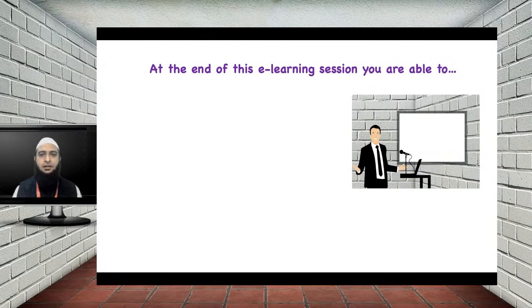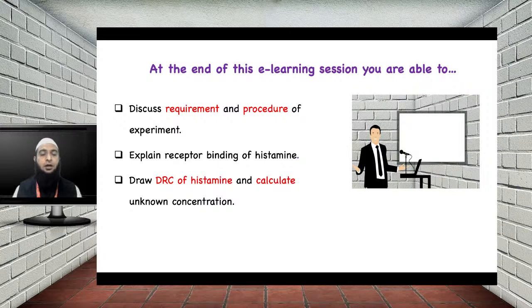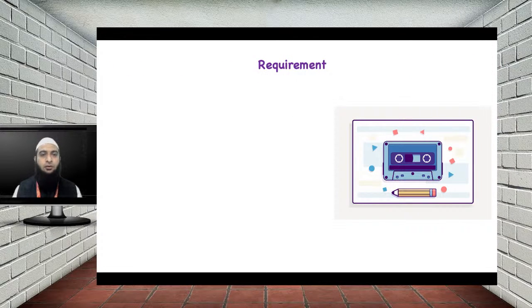At the end of this e-learning session, you will be able to discuss the requirement and procedure of this experiment, explain receptor binding of histamine, and draw the DRC of histamine and calculate the unknown concentration. So let's start with the requirement of this bioassay.